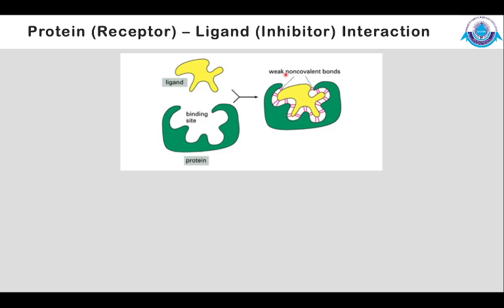However, all these methods are theoretical and give you a theoretical binding affinity. It is very important in the drug discovery process to validate these findings. This can be done by performing various experimental methods that determine the binding affinity or the binding constant of a specific ligand to a protein. In the drug discovery world, we usually refer to this binding constant as IC50.